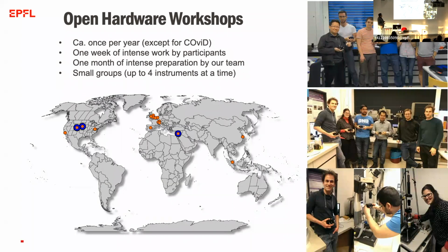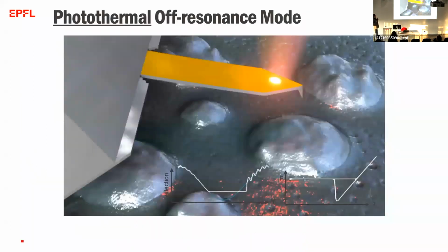So now getting back to the science, our high-speed AFM is slightly different than others. And one of the enabling features that we have is that we are trying to increase the speed of the imaging by increasing the speed at which we collect the data at every data point.